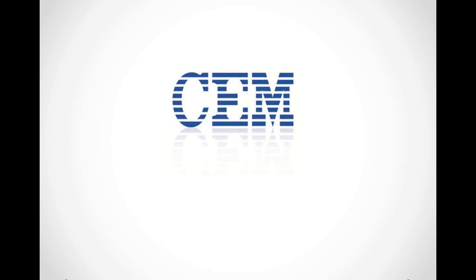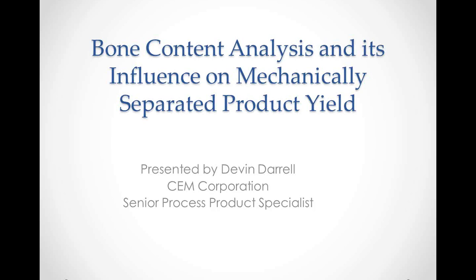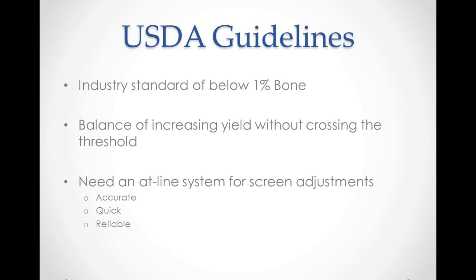What can you tell us about bone content analysis? All right. Well, first I'd like to welcome everybody to this brief webinar about bone content analysis. Thanks for taking the time to join us. As Michelle said, my name is Devin Darrell. I'm the product specialist for the process control branch of CEM Corporation. Throughout this webinar, I will discuss the purpose of bone content analysis, both from the perspective of regulation and economics, followed by an overview of the available products on the market for bone analysis.